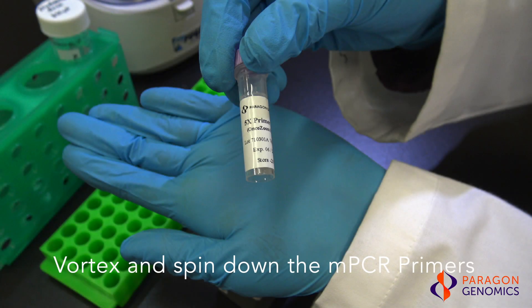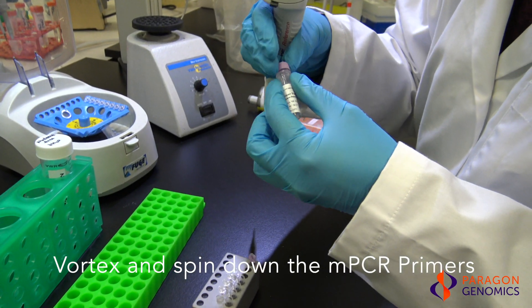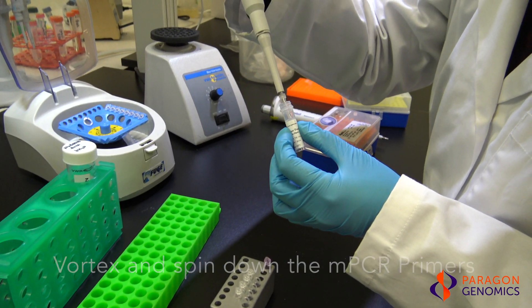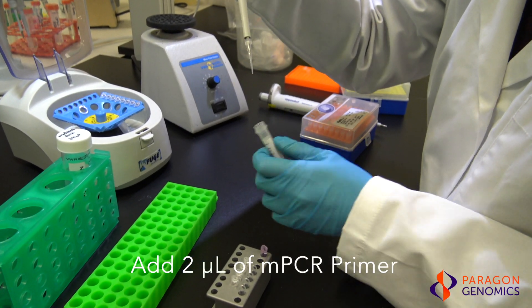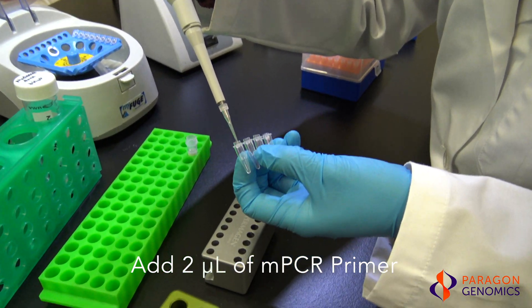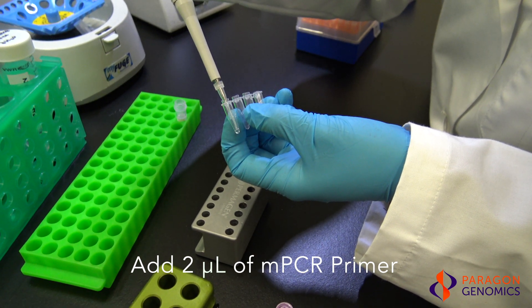Vortex to mix and quickly spin down the multiplex PCR primers before adding to the PCR tubes. Make sure the multiplex PCR primers are fully thawed out. Add two microliters of multiplex PCR primers into each PCR tube. Pipet slowly and rinse tips in solution as needed to ensure accurate dispensing.